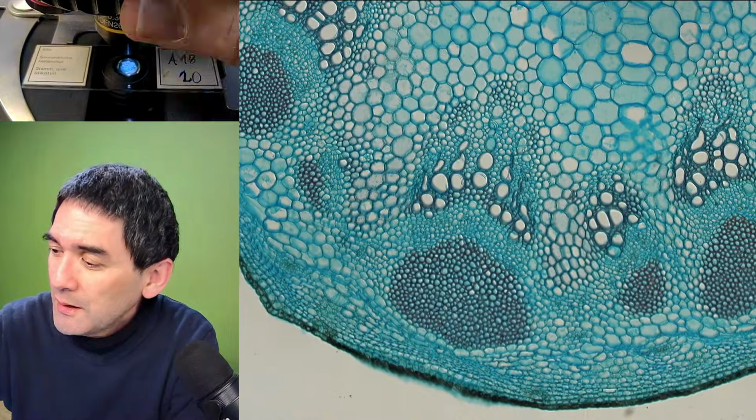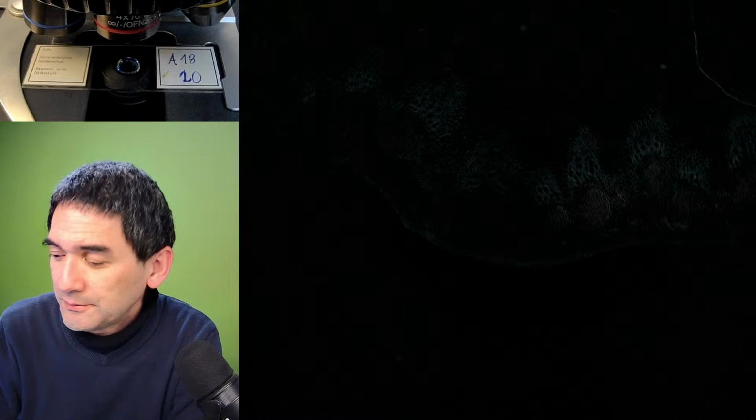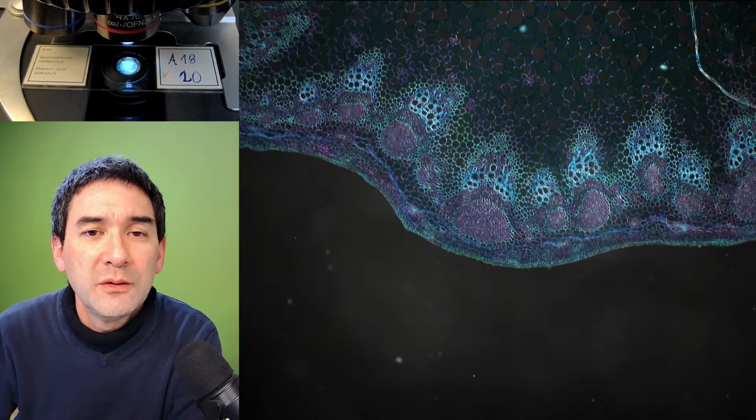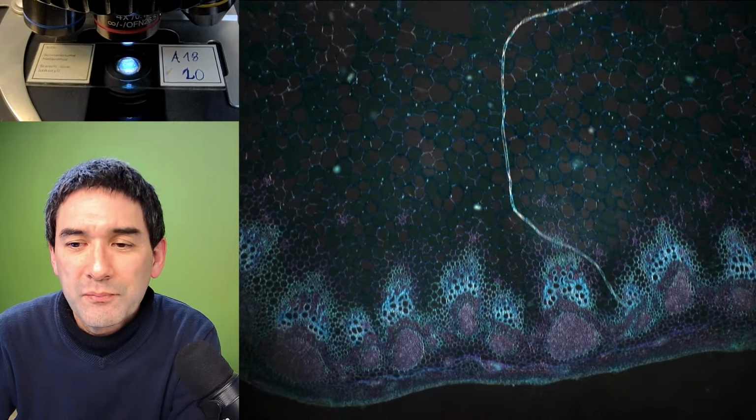So this is also one of those nice ones. Let me try how this looks here. And you see, this is again in dark field. Look, a little bit of dust and dirt here.